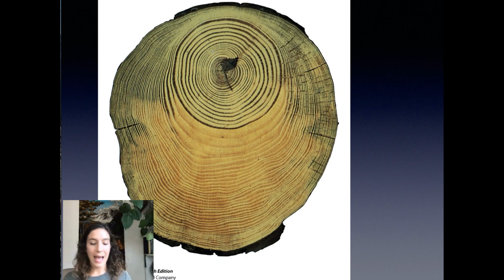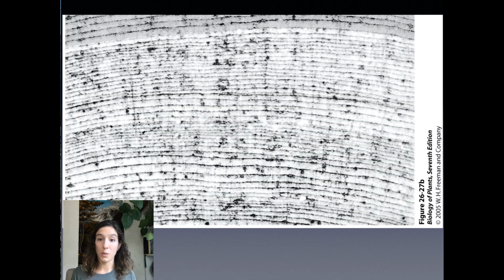And when we look at a very old stem like this, that we know now is entirely made up of secondary xylem, we can now interpret what these lines mean. So let's take a closer look at this. Let's zoom in on this part of the stem right here. So that's what we've done in this picture.